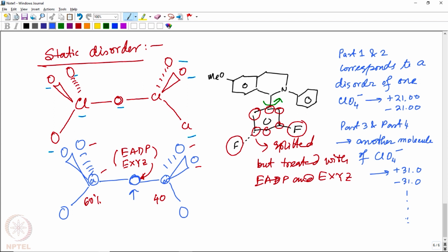If we reach a limit beyond which we are not able to refine, we should stop and get back to our work and make suitable comments in the structure refinement part while writing the publication, that this data cannot be further refined using more disordered fragments.